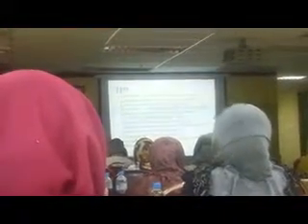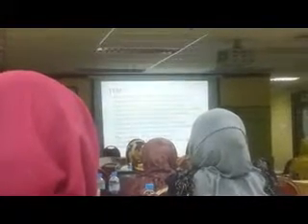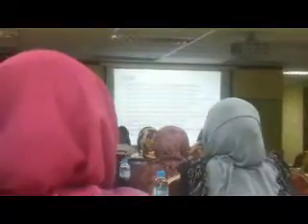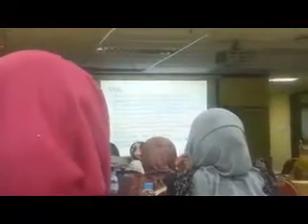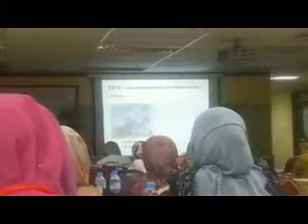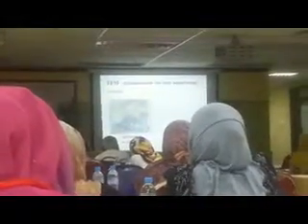Understand? So TEM can give you much more magnification, but as I told you, TEM sample preparation is very tedious. You really have to work a lot to prepare a TEM sample, and after that you will find you have pressed too much so that there are many dislocations. Then the operator will ask you to go and prepare a fresh sample. It happened to me many times. So with TEM, you can see dislocations. These are dislocations in the sample.